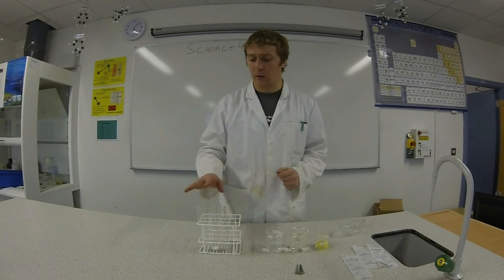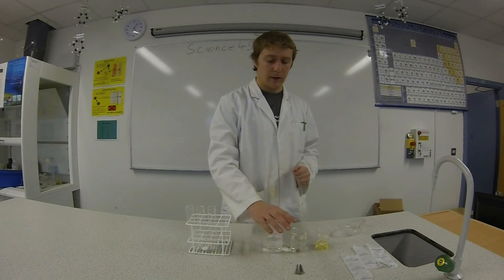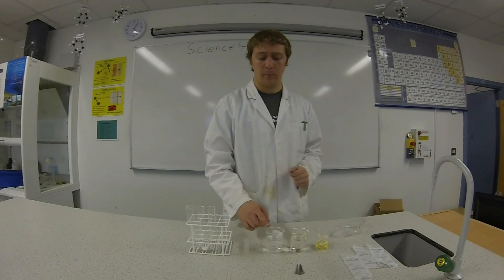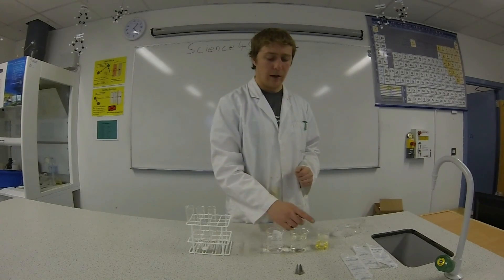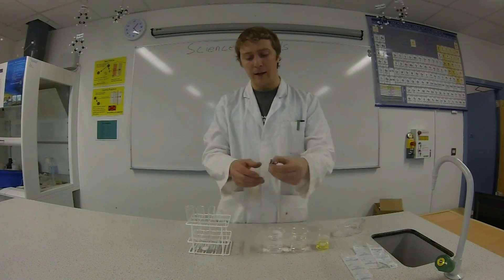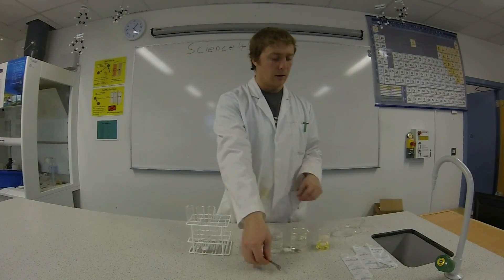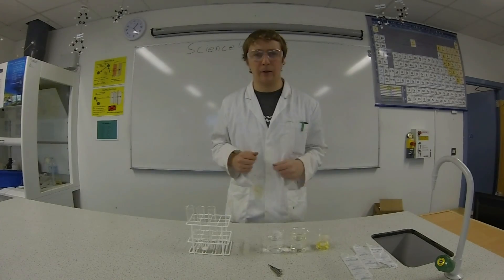Equipment today: we're going to need three test tubes, a test tube holder, a couple of beakers — one with boiled cooled water, one with plain tap water, and one with oil. We're going to need some iron nails — we have three iron nails — and as always, we need our goggles so that we can see the results.